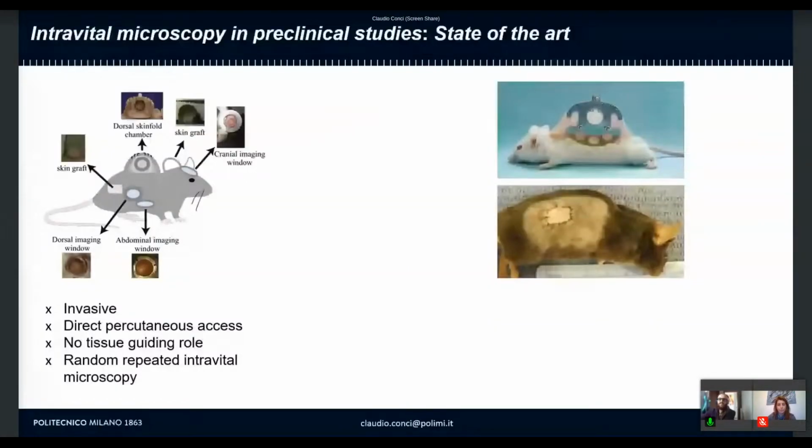So we start with the biocompatibility assessment of biomaterials or new drugs in general, which entail an inflammatory event primarily reflected in cell behavior at the microcirculatory system. The current protocols used in preclinical studies are based on histopathology, but these protocols are over 40 years old and require the sacrifice of a huge number of laboratory animals, with, as you may know, an unsustainable ethical burden of animal research.